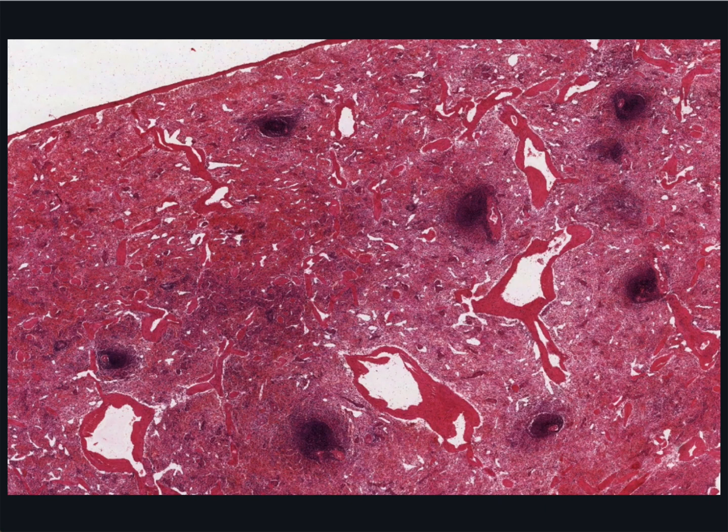In contrast to the thymus, there is much to see in a section of the spleen. The organ is divided into lobules, even though they can only be imagined here in a tissue section, because the connective tissue is too scant to outline them.